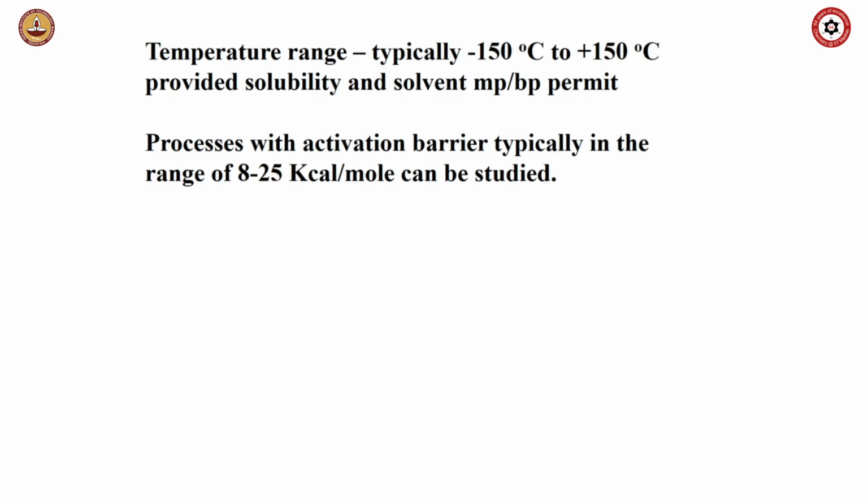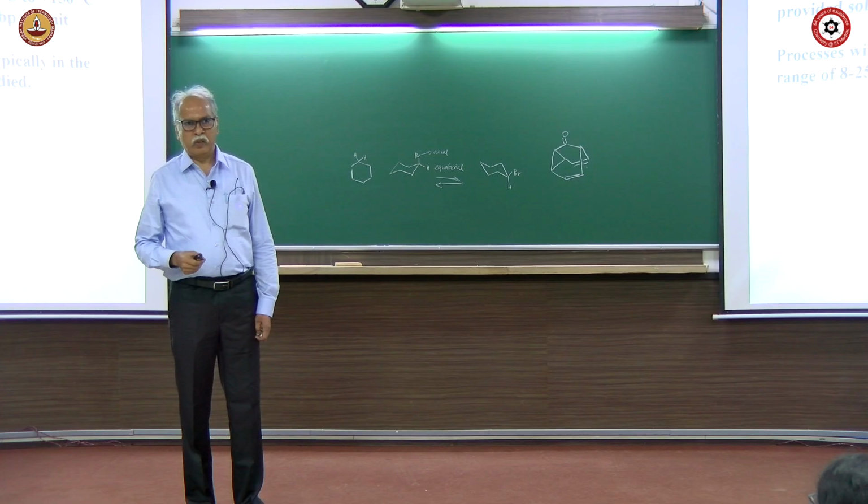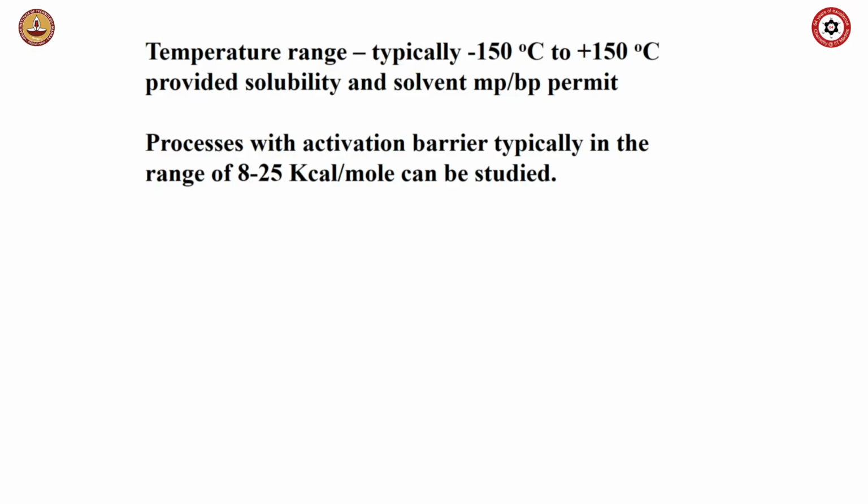So it is possible to record NMR spectra at these temperatures, provided your solubility is not a problem, provided your solvent doesn't freeze during the course of the measurement. These are the two experimental restrictions you have. Otherwise, theoretically, it is possible to study NMR spectroscopy in this temperature region.